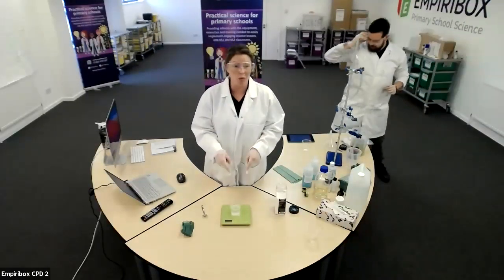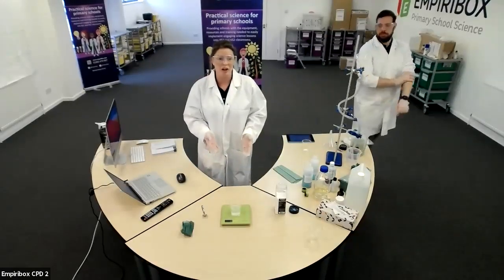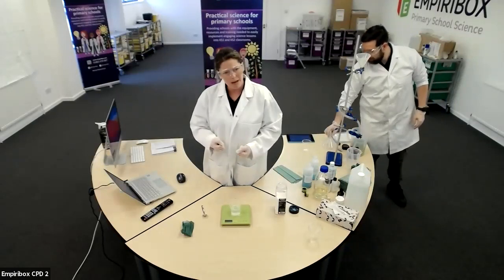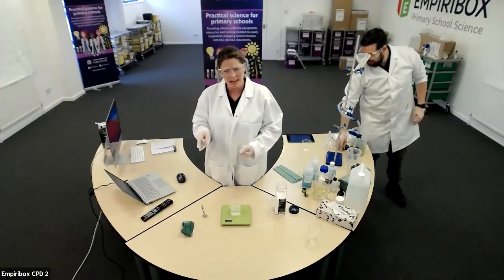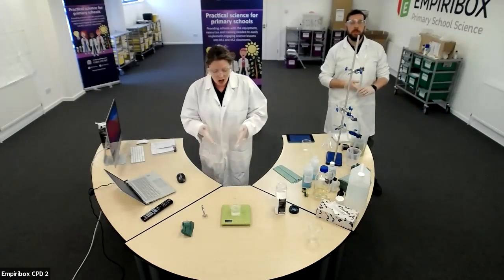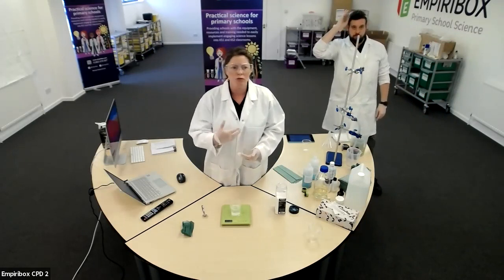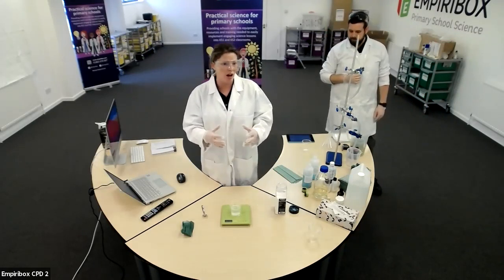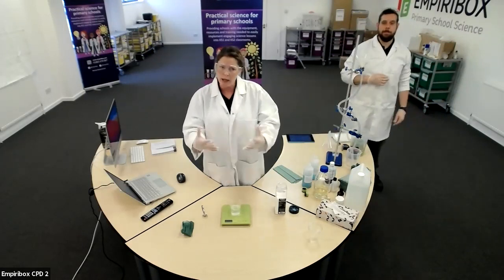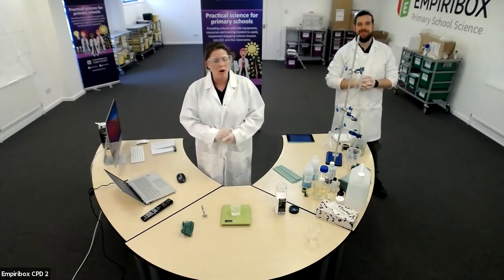Absolutely. So actually what you've just seen here, I could have evaluated this practical really nicely, couldn't I? Because one of the things that I could have looked at if I was evaluating this is, maybe next time if I was to do this experiment again, I might look at something like the elephant toothpaste reaction. So if I could have done this again, how could I make sure that my results are more accurate and reliable? Well, by using less of the acid in the beaker, I'd lose less over the sides, wouldn't I, and therefore I'd get a better reading on my balance.